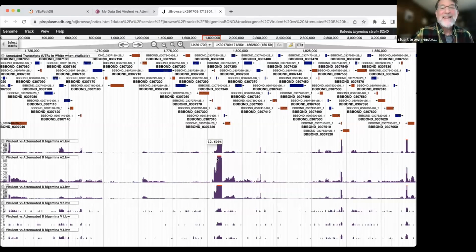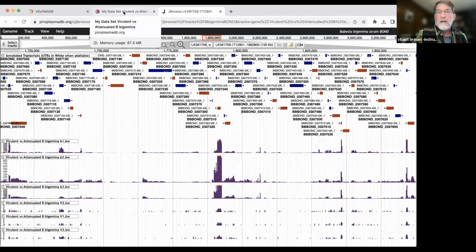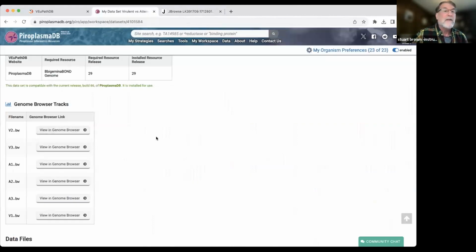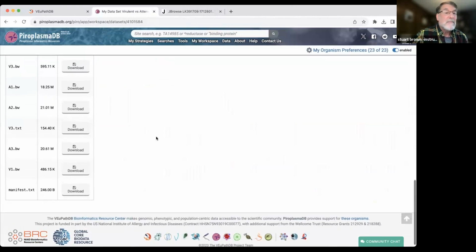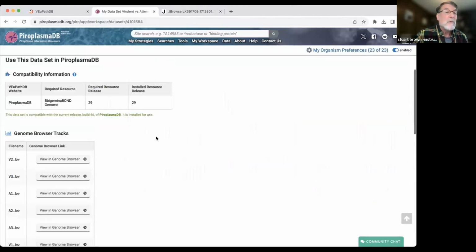Okay. So I'm a little worried about this because the DESeq2 algorithm, while it does normalize for coverage, can't compensate entirely for very different coverage among all the samples for one treatment versus another. That's what we would call a confounding factor, and not necessarily something that you would want.